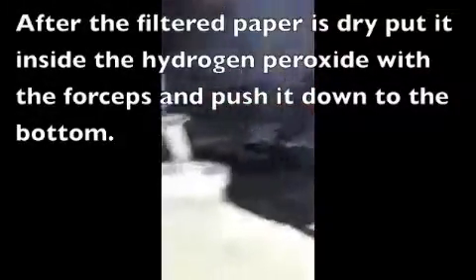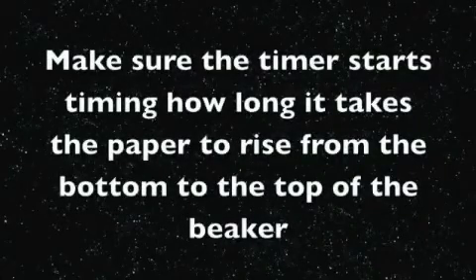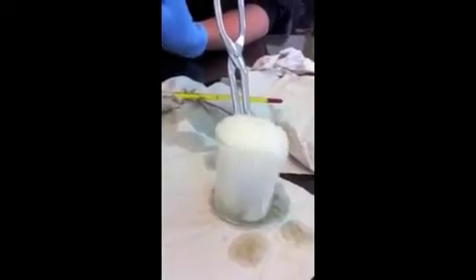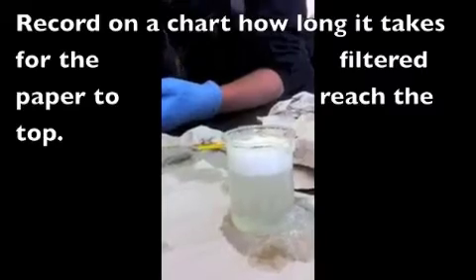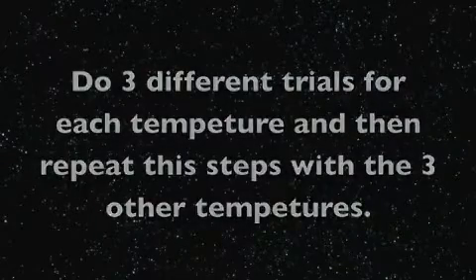After the filter paper is dry, put it inside the hydrogen peroxide with the forceps and push it down to the bottom. Make sure the timer starts timing how long it takes the paper to rise from the bottom to the top of the beaker. Record on a chart how long it takes for the filter paper to reach the top. Do 3 different trials for each temperature and then repeat these steps with the 3 other temperatures.